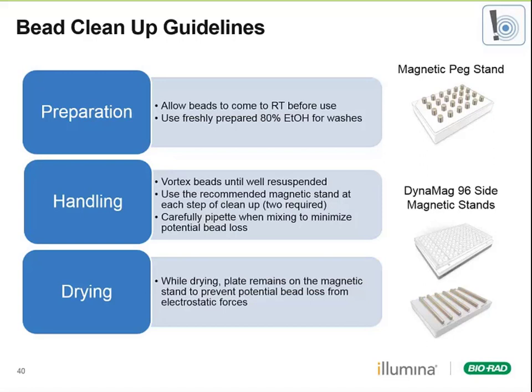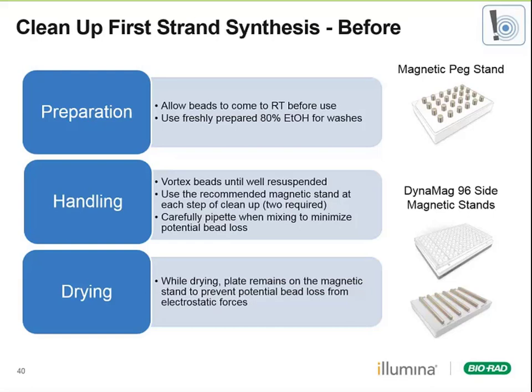Also, when we're handling the beads and pelleting them on the plate, we want to be careful during our washes. We generally don't want to target the pellet directly because we can have some bead loss there. When we're drawing the beads, we want to make sure to leave the plate on the magnetic stand to, again, prevent potential bead loss from the pellet.